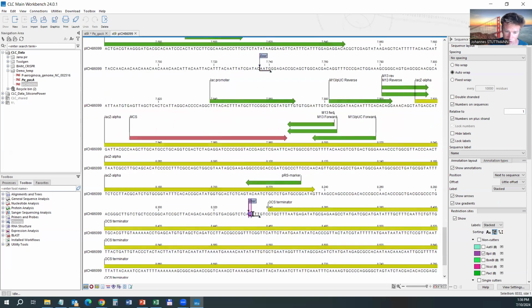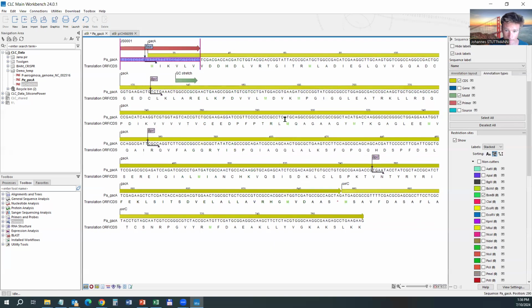So here now we see a GCTT overhang. Okay. So where would we have to select this? Since this is just about expression of a gene, so now with a bacterial gene in a plant, and I do not have a translational fusion or anything, I could theoretically put this anywhere. So, well, anywhere downstream of the GAC-A gene, but it also doesn't make sense to include additional genes. So I would place this overhang just here, and also my second cloning adapter.